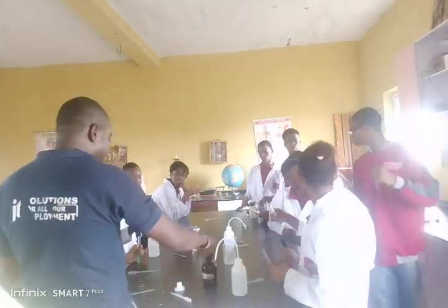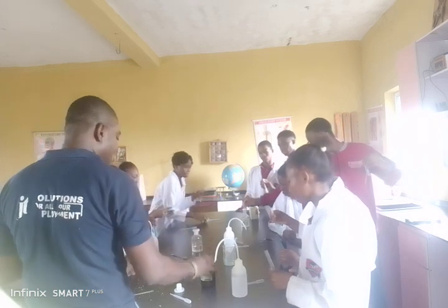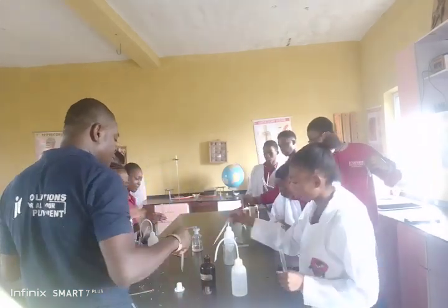So, what's the next thing? Followed by AgNO3. So let's take AgNO3.